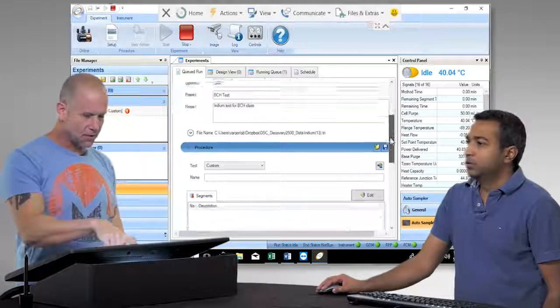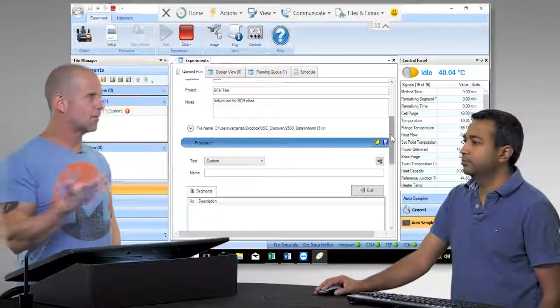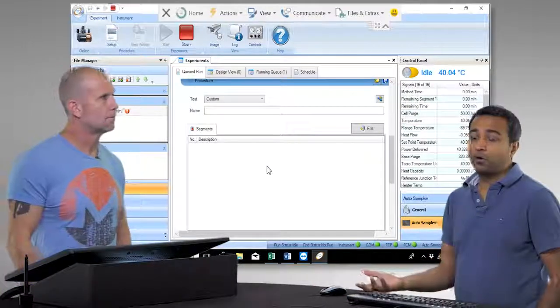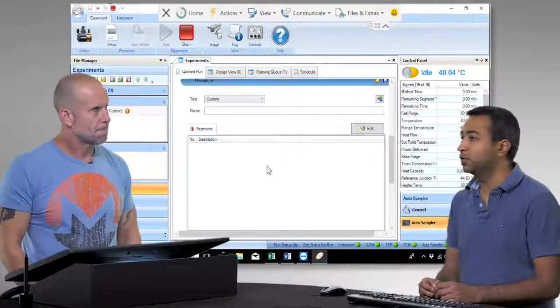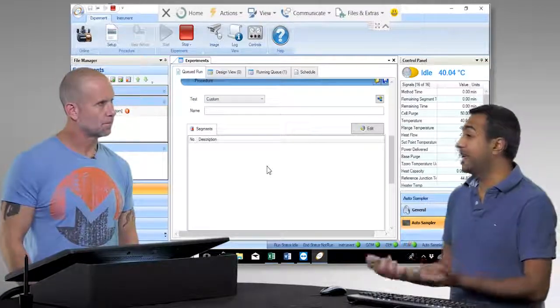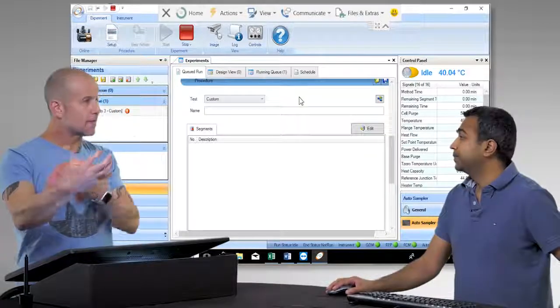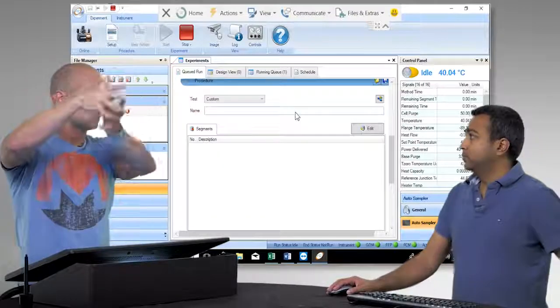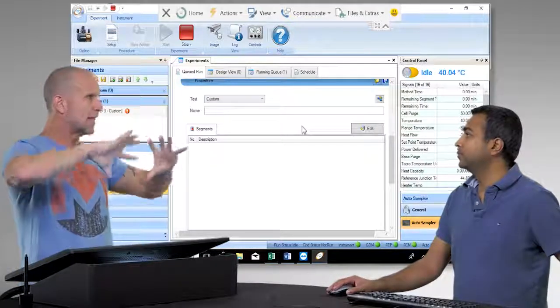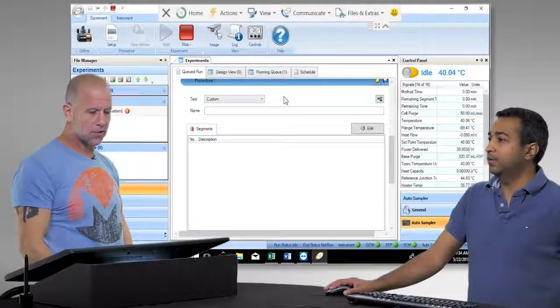Now the only other critical item to put in here is the actual program for the temperature profile you want to run the experiment over. You typically have some idea about your sample — what range you expect transitions in. These things can be intricate: you can have all sorts of isothermal ramping conditions, and you can add many different steps. You can also make a name to save that specific set of conditions so you can use it for another sample or come back and use it again for reproducibility.